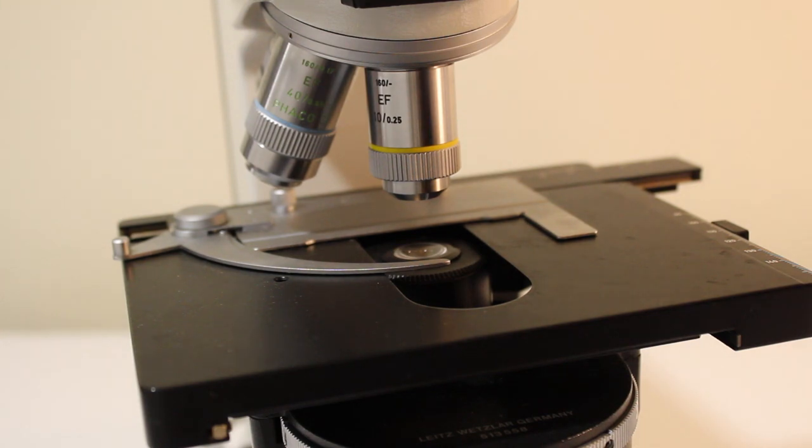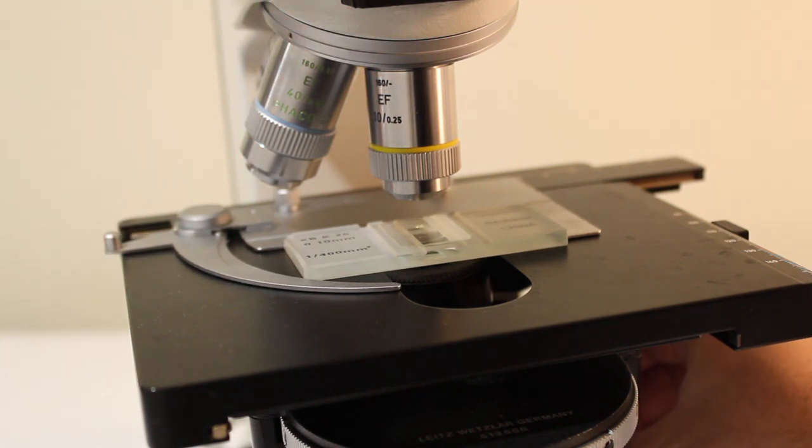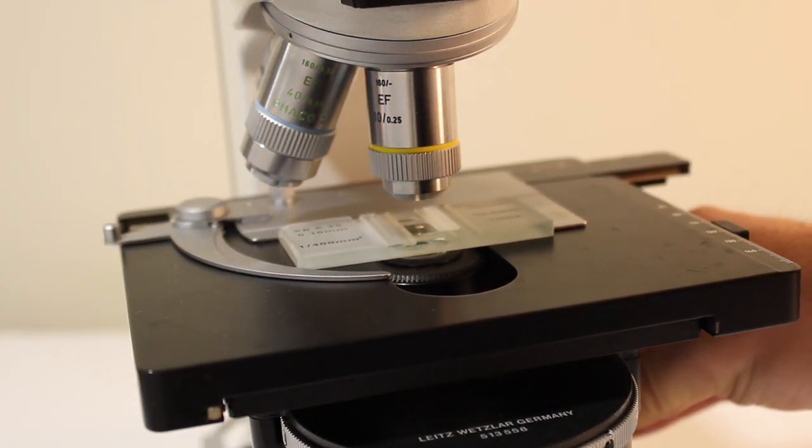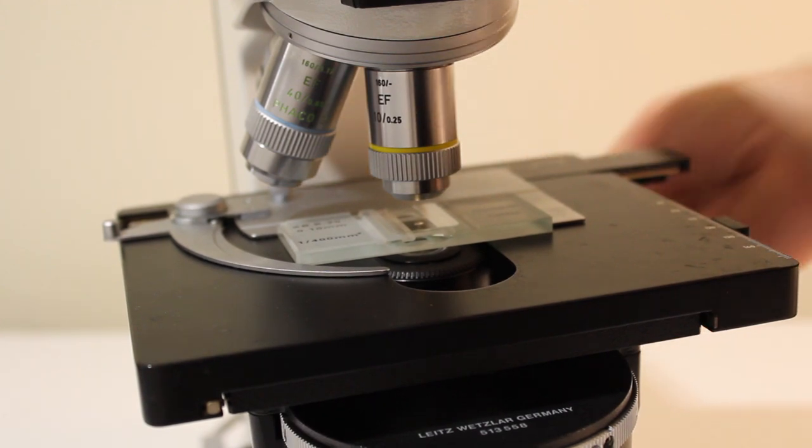Once your hemocytometer is loaded, place it onto the stage of your microscope, center your microscope over the grid in which you're planning on counting, and then focus on the grid using your lowest magnification lens.